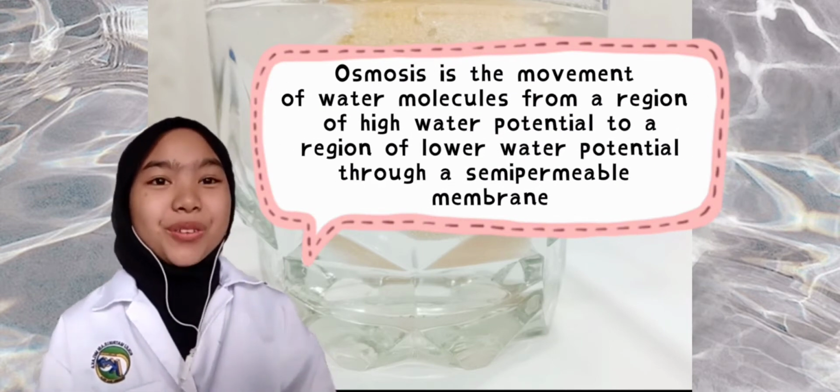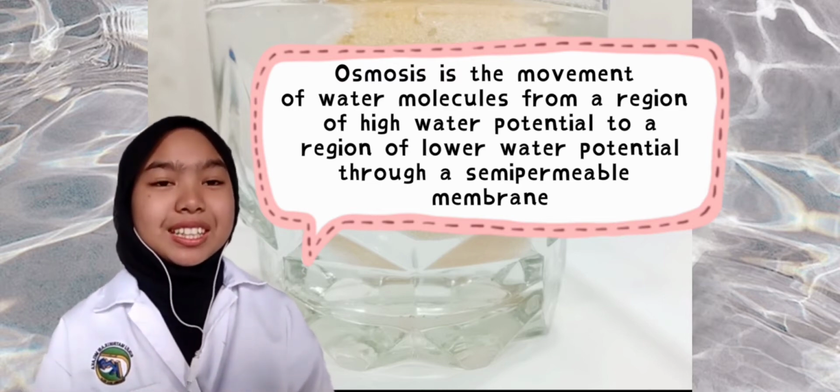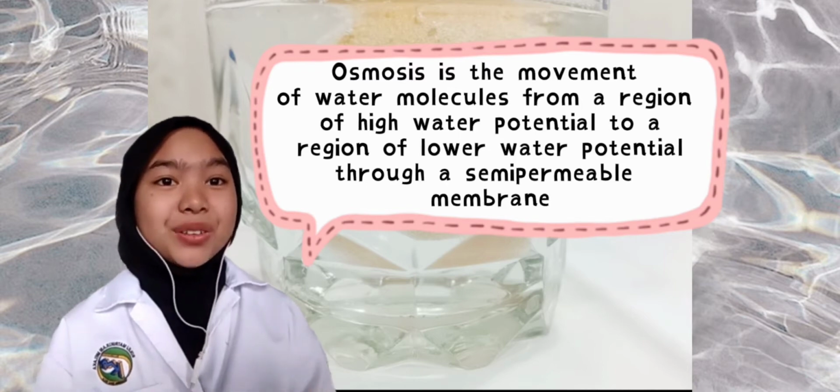Osmosis is the movement of water molecules from a region of higher water potential to a region of lower water potential through a selectively permeable membrane without using energy.